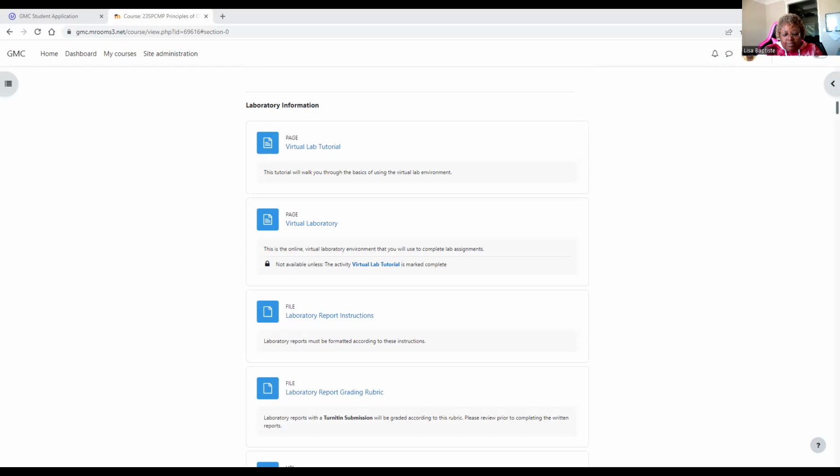And so the weighing boat measures 4.7046. And anytime you are working with measurements for the balance, all of those numbers are significant. We talk about significant numbers in your measurements, and you'll talk about that in this week one. But all of those numbers will be significant. And so it's important that you do write down all the numbers. Once you've done that, you're going to tare that again.